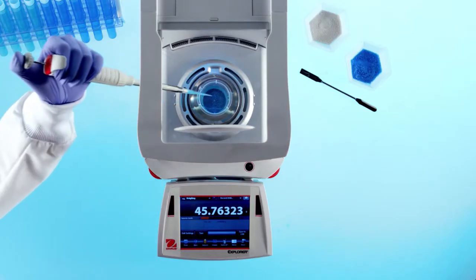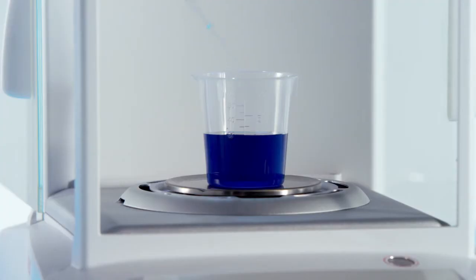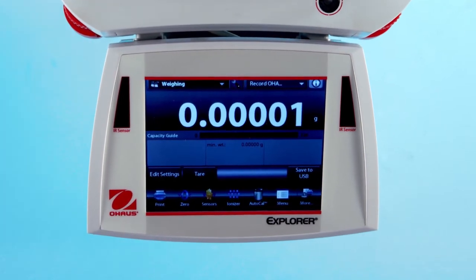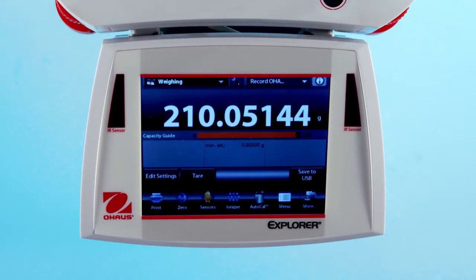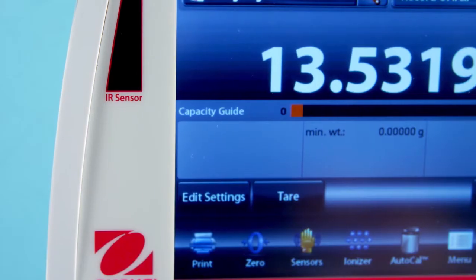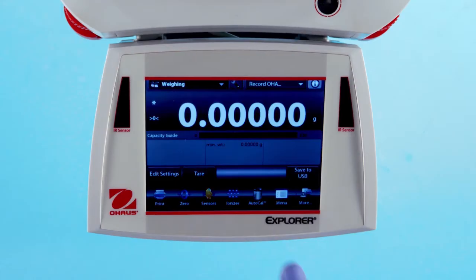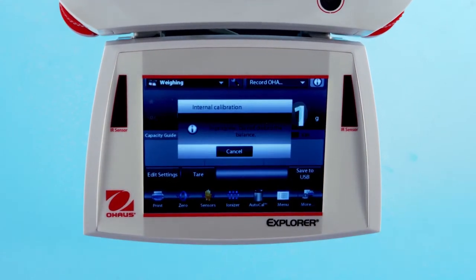Explore the possibilities of its intelligent performance with .01 milligram readability, 220 gram capacity, fast stabilization with audible alert, and standard AutoCal internal calibration.